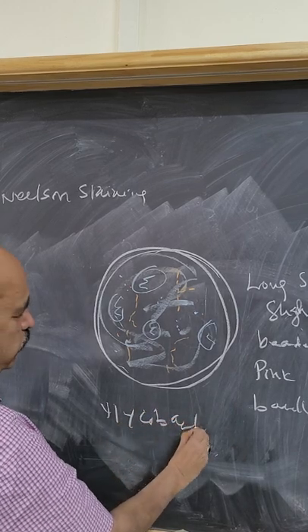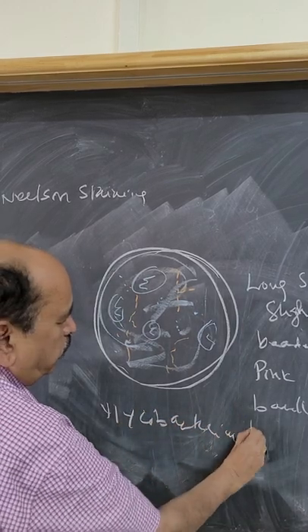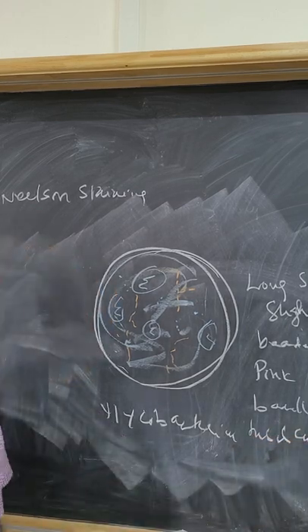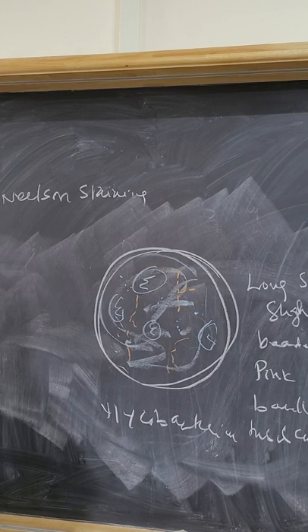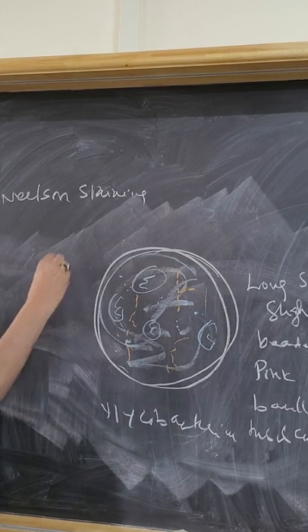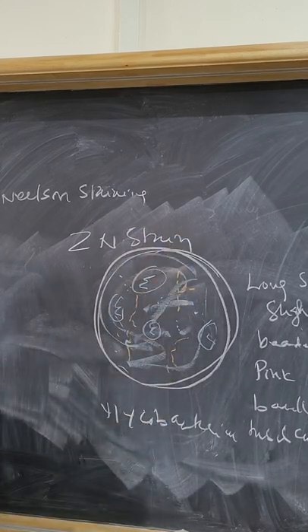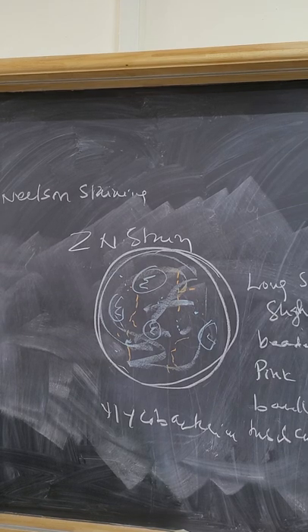Mycobacterium tuberculosis. If you do not know the spelling of Ziehl-Neelsen staining, just write it as you can, okay? Draw the diagram, write the report, and after that, what will you do in the examination? You have to raise your hand and say, Sir, I have finished Ziehl-Neelsen staining. Raise your hand like this.